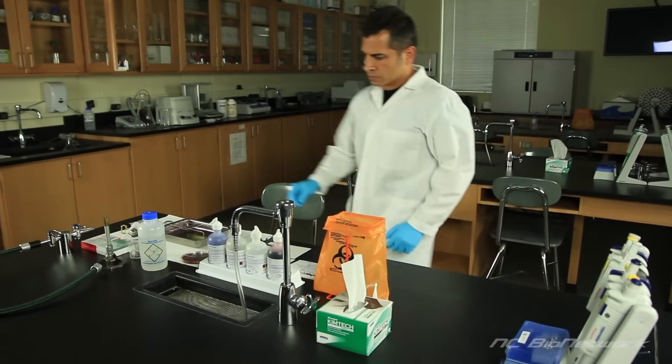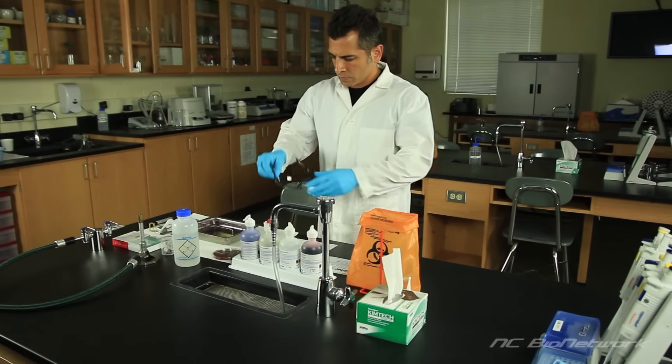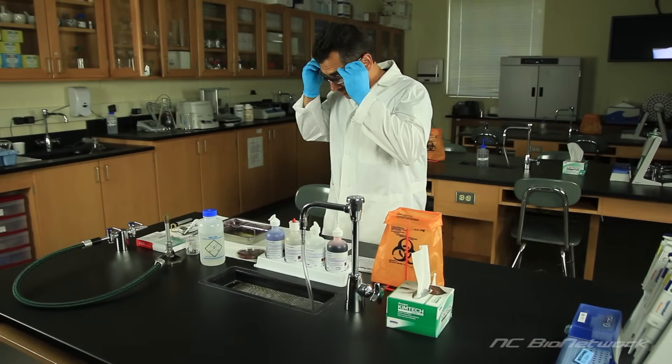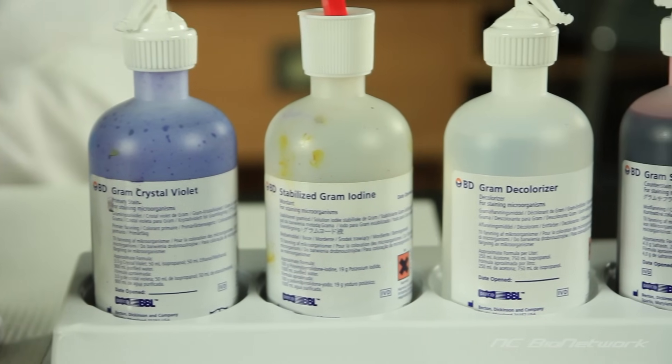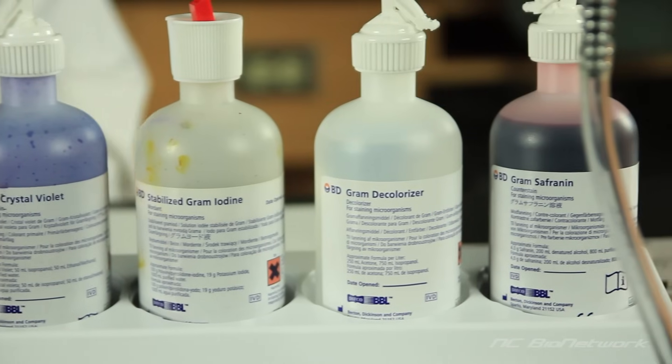Applying a simple stain to a bacterial culture is a technique used for examining the size, shape, and arrangement of a specimen. It uses a dye to stain the cells, making them easier to see under a microscope.